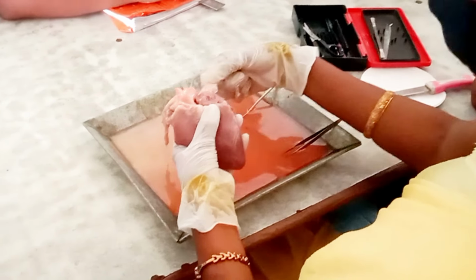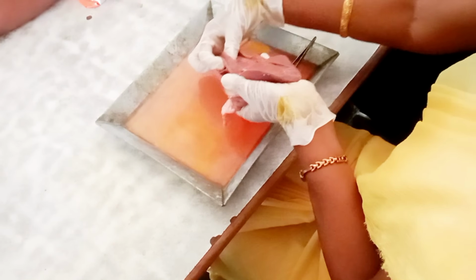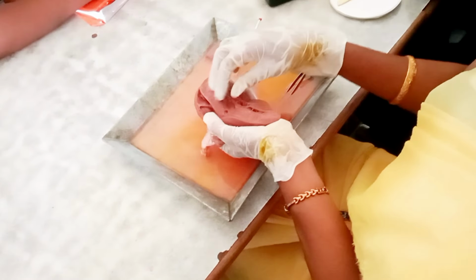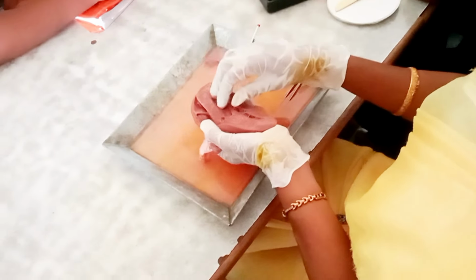Let's observe ventricles internally. These are known as ventricles. This is known as ventricular septum. See how thick it is. Here are chambers on both sides of this. This larger chamber is actually right ventricle and the smaller chamber is left ventricle. From this, systemic aorta arises. From larger chamber, pulmonary artery arises and carries the blood to lungs.